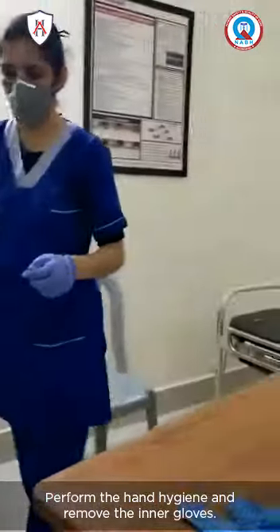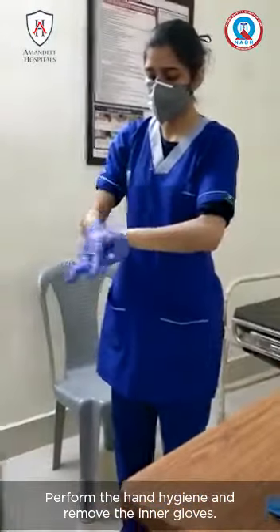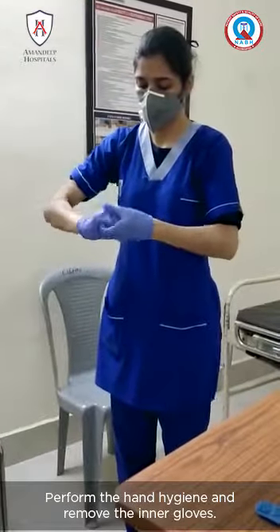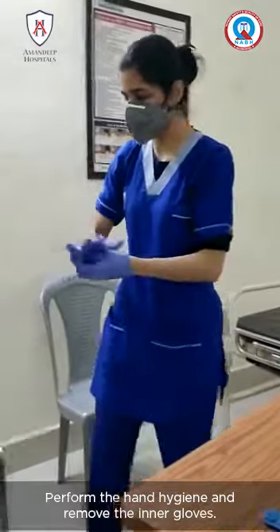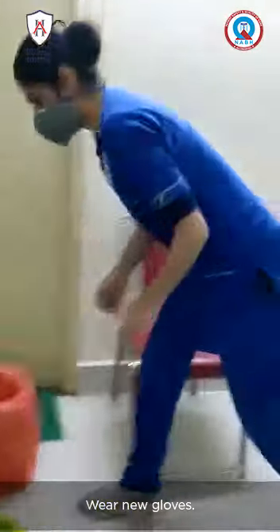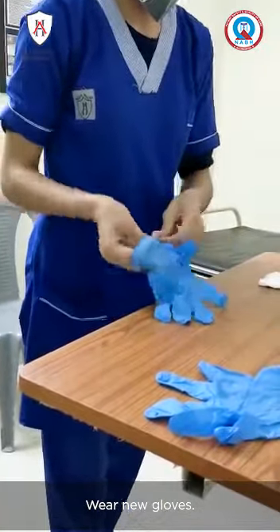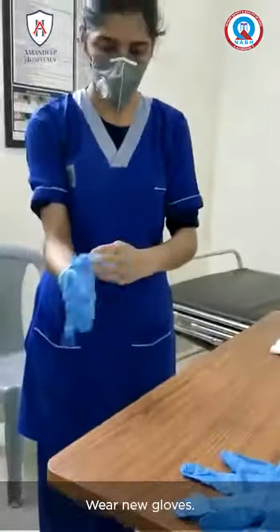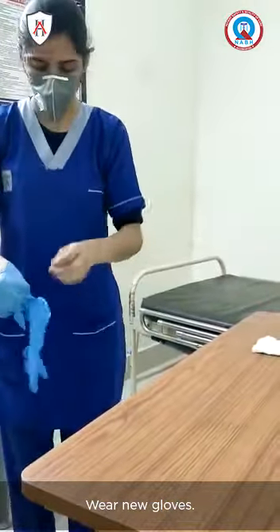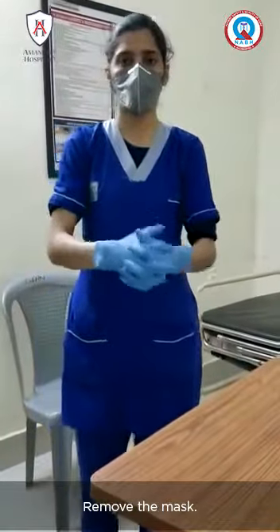Perform hand hygiene and remove the inner gloves. Wear new gloves, then remove the mask.